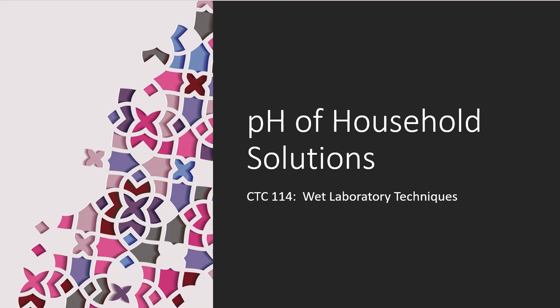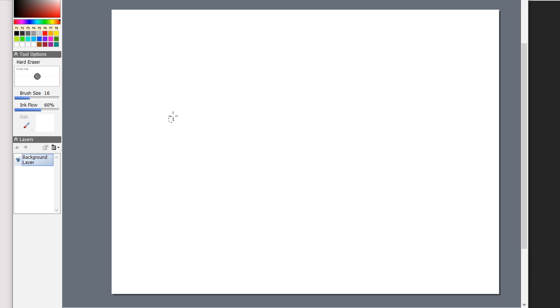CTC 114. You've survived! You survived the first round of laboratories that we've given you. If you look at those labs, what do they have in common? What they have in common is that they all forced you to work with compounds and report something that we call physical properties.